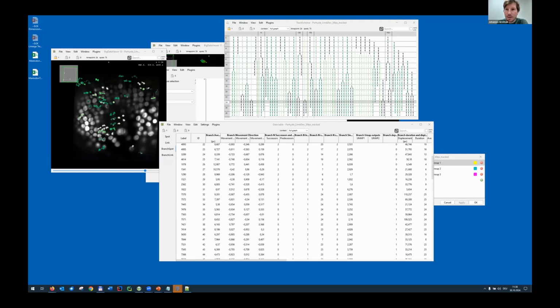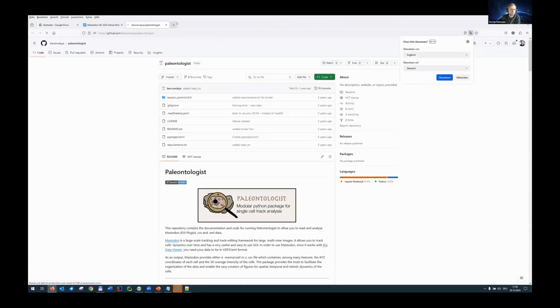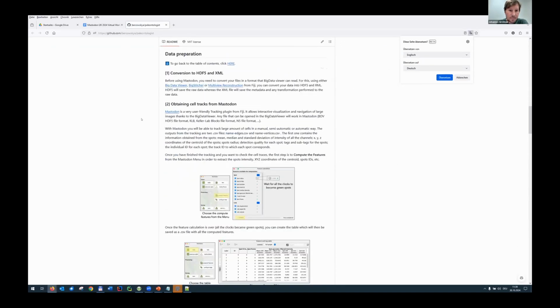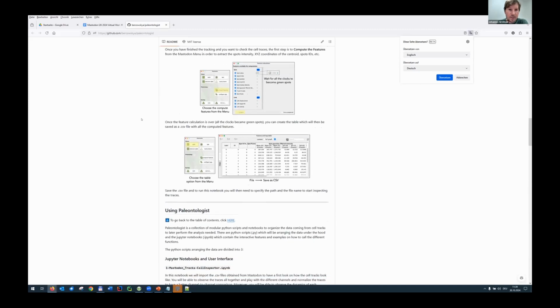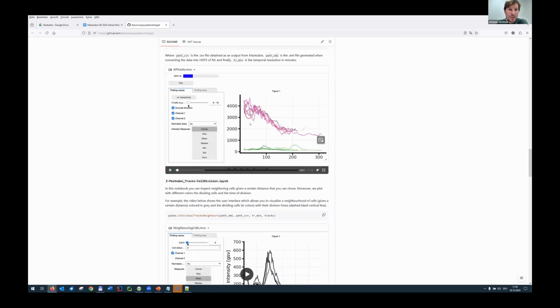And there's also the paleontologist that I mentioned at the very top when you started. There's also a link in there. Maybe you could briefly click on the link, Stefan, since you're still sharing? You mean this one? Yeah, exactly. If you go down here, it gives you some videos and previews. You should be able to follow the installation guide, and then you can create plots and analysis. And this is really directly linked to the Mastodon export format also.